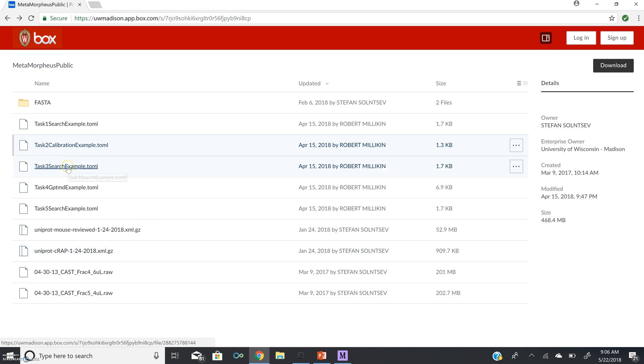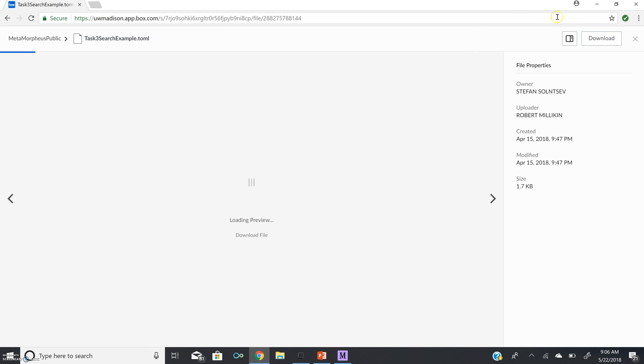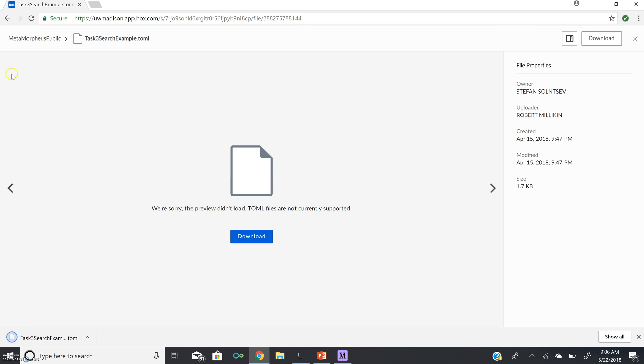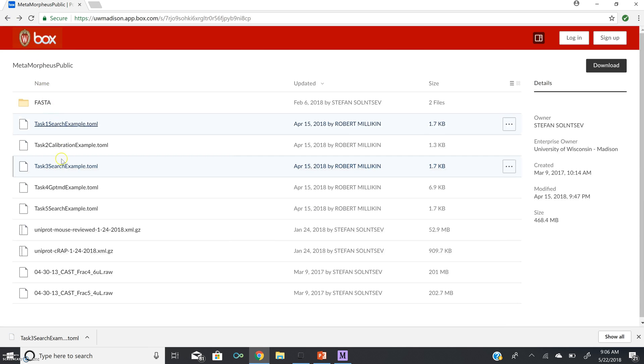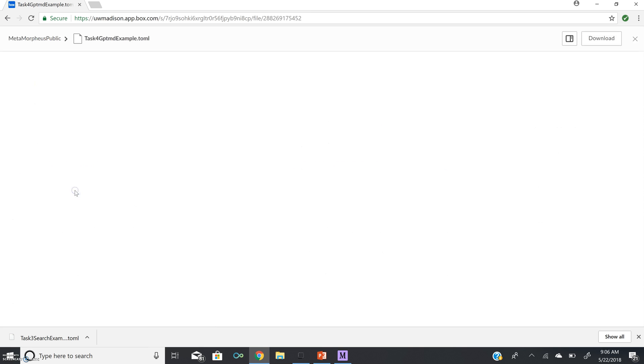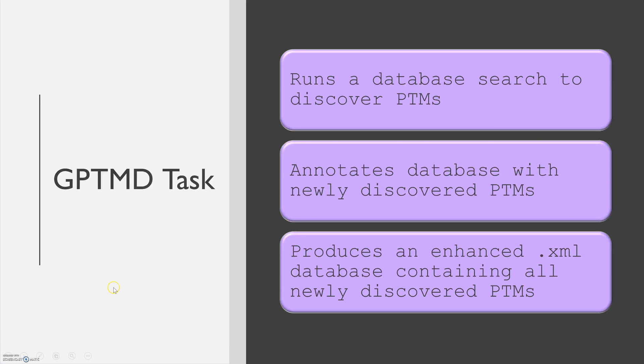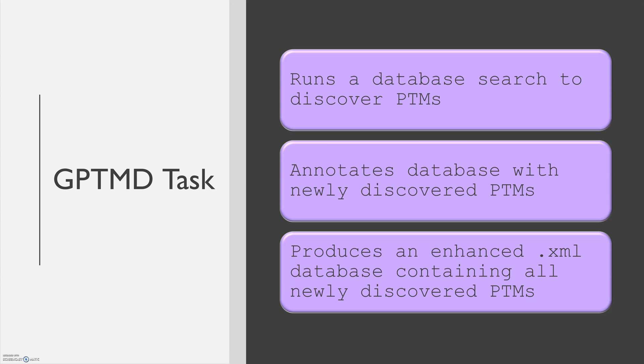Next, we are going to download task 3, a search example. And then task 4, a GPTMD task example. The GPTMD task, or Global Post-Translational Modification Discovery task, runs a database search to discover post-translational modifications. It then annotates the database with these newly discovered post-translational modifications and produces an enhanced XML formatted database containing all newly discovered PTMs.